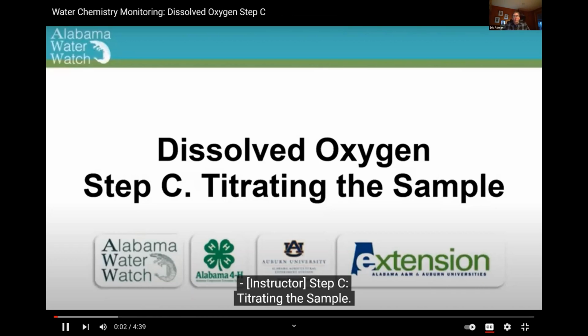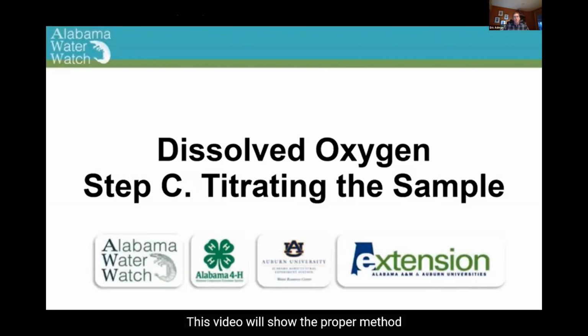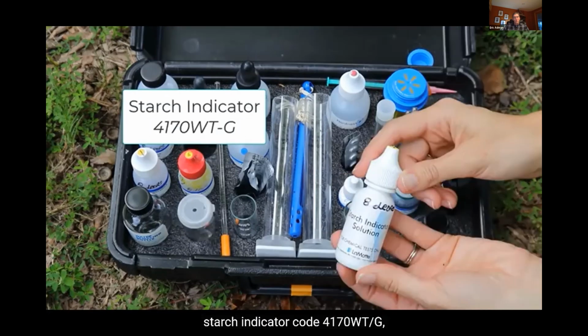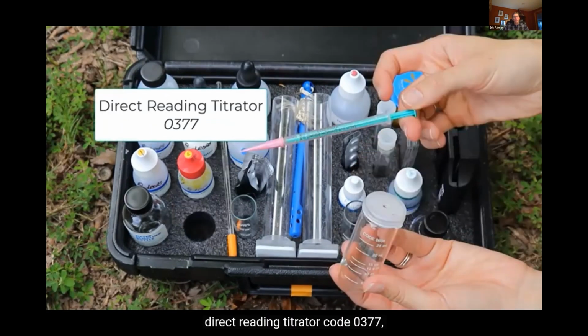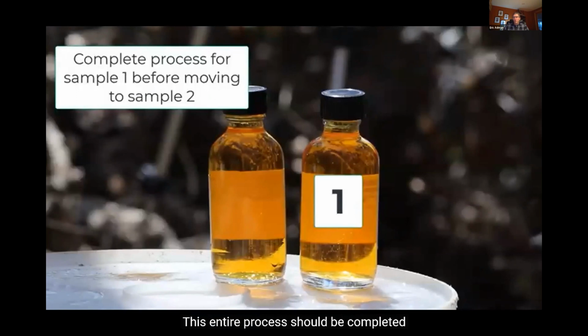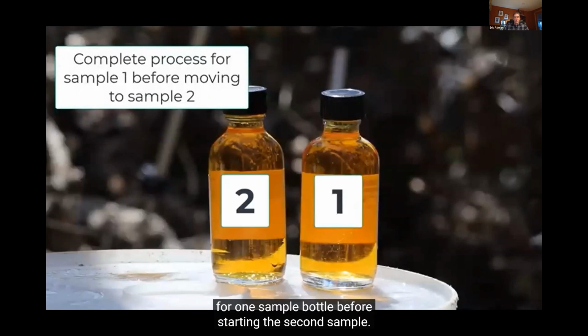C, titrating the sample. This video will show the proper method for titrating water samples as part of the dissolved oxygen test. For this step, you will need titration tube code 0608 or 0299, starch indicator code 4170WT/G, direct reading titrator code 0377, and sodium thiosulfate code 4169-H. This entire process should be completed for 1 sample bottle before starting the second sample.